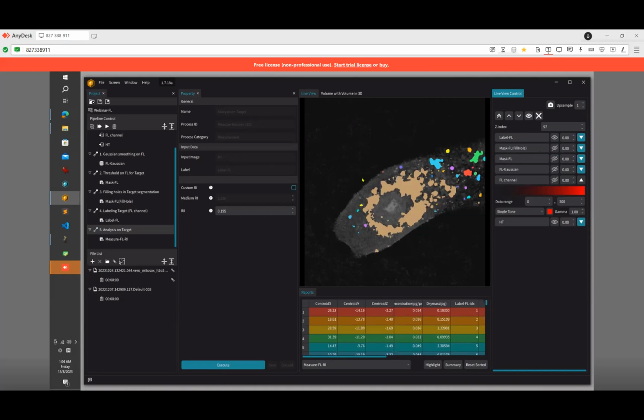You can control all of this on the left side. When you press this single triangle button, it runs the pipeline once to test a selected data set. And when you press the double triangle, it uses the parameters to analyze all the files listed here.